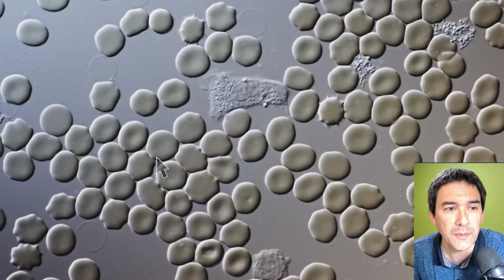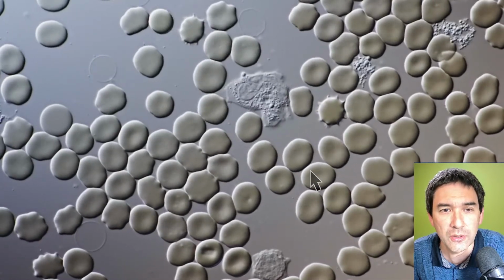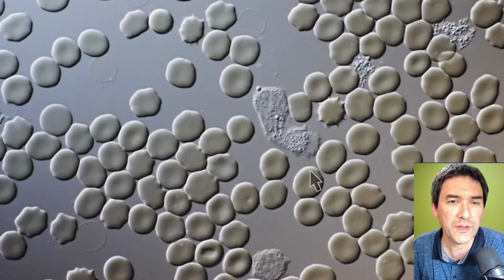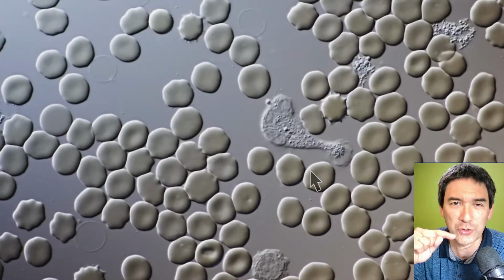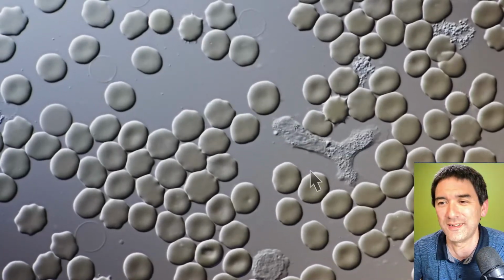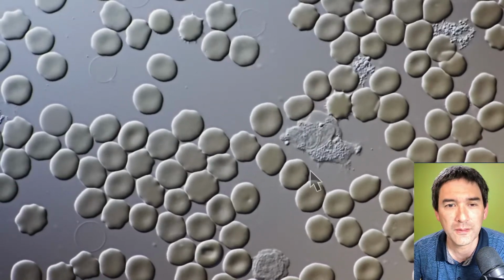This is a very, very thin layer of blood, and that's why all of the blood cells are basically in one plane. I've also tried to do this with a little bit more blood, but then it can happen that the white blood cells move vertically in and out of focus. But actually, I think that's quite fascinating.